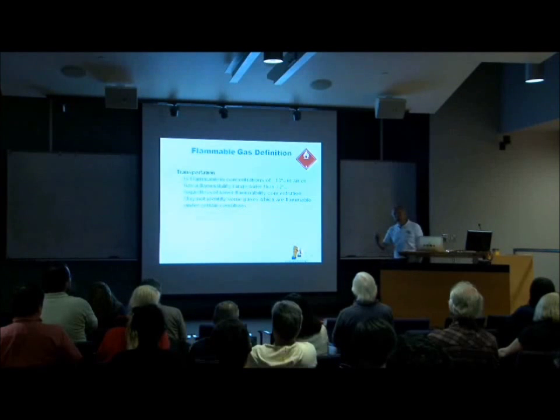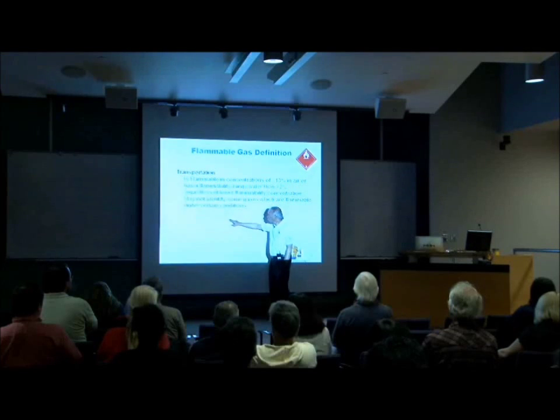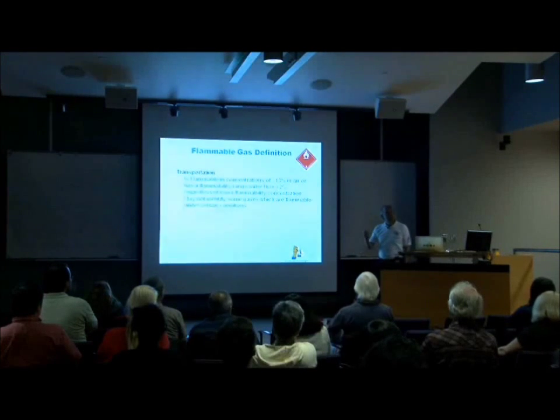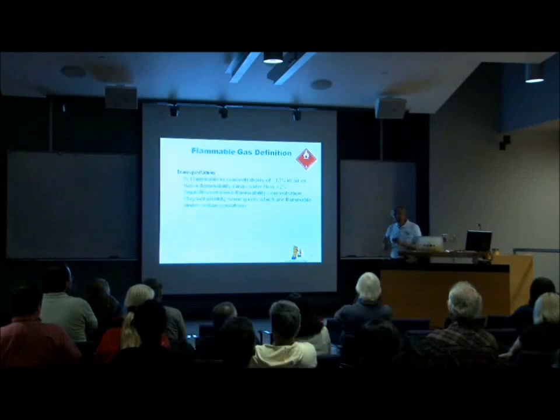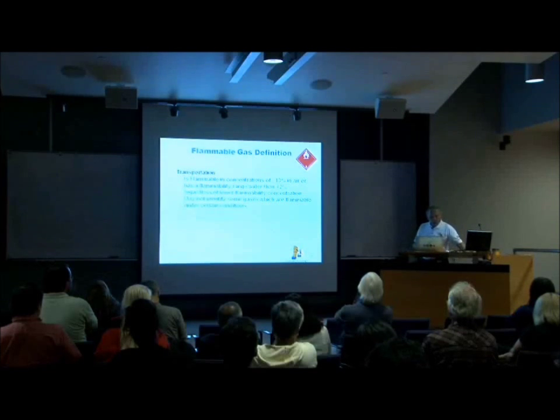What you need to do is look at an MSDS sheet to make sure that it's not flammable at certain concentrations. The reason why I point that out is many of the replacement freons leave a hydrogen on it so it's not fully fluorinated. As a result, it's flammable under certain conditions. So you need to be aware that many of these replacement freons exhibit the same property as ammonia.